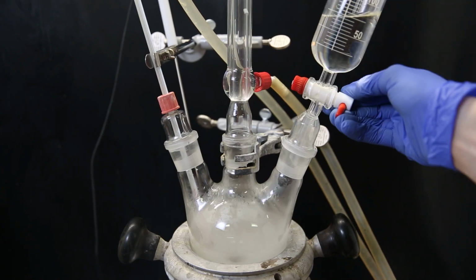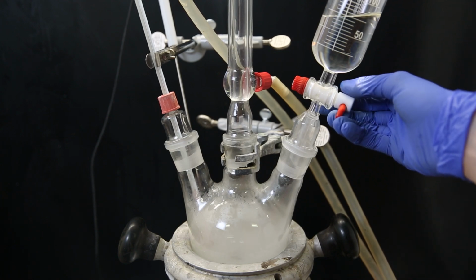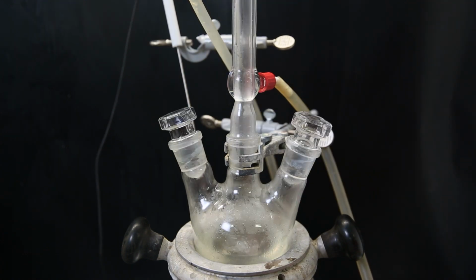I start heating the flask to about 65 C and gradually add the thionyl chloride to the flask. I continue the addition slowly while keeping the temperature between 65 and 95 C. When the addition is complete, it is a clear yellowish liquid. I then heat it to a reflux and leave it overnight.